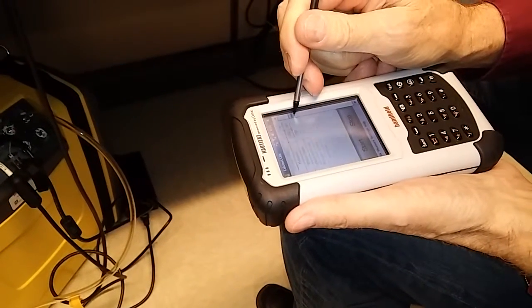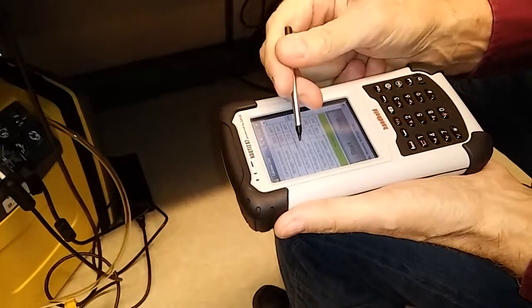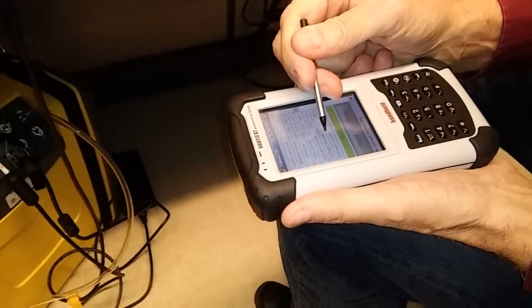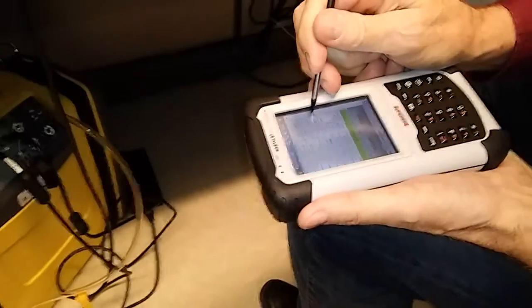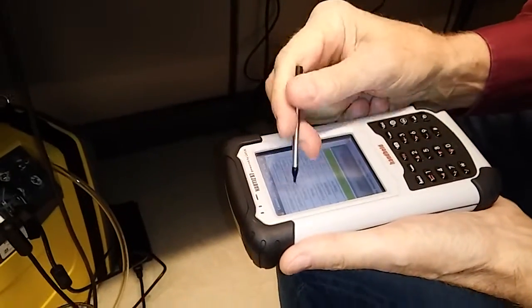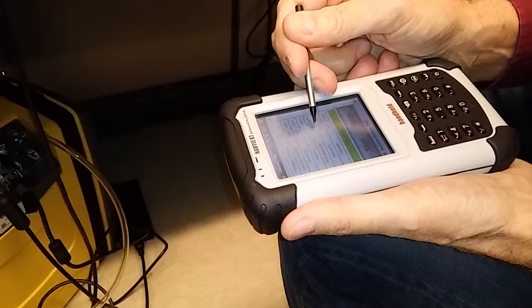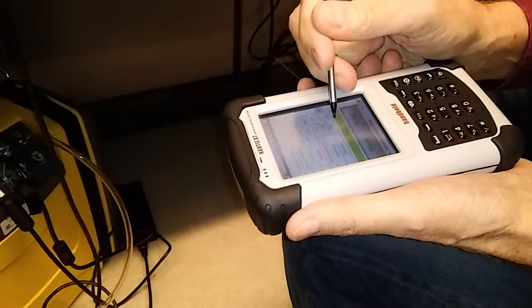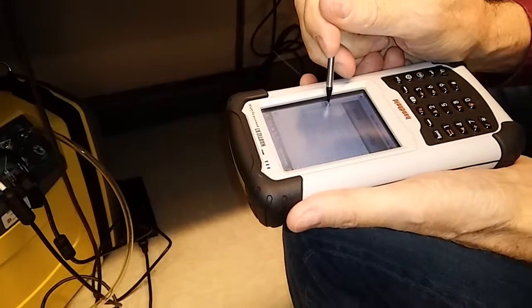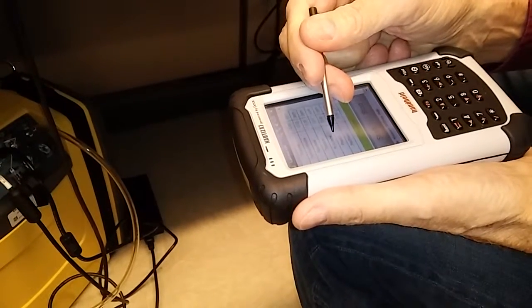Low ammonia, sulfur dioxide. So with this internal library, you can do sulfur dioxide, hydrogen chloride, hydrogen fluoride, hydrogen cyanide, carbon disulfide, we don't do that. Ethylene, hexane, formaldehyde, you can do formaldehyde, benzene, toluene, metaxylene.